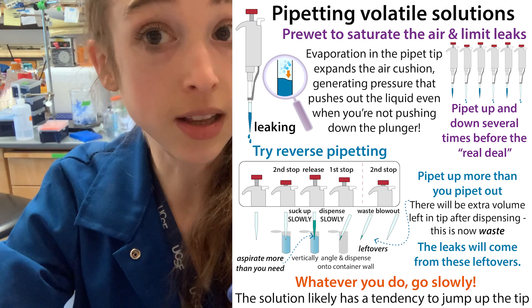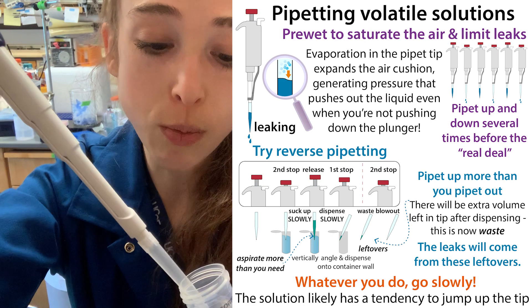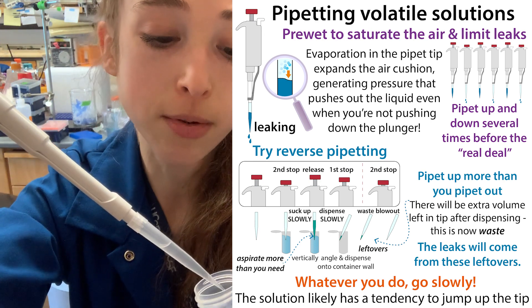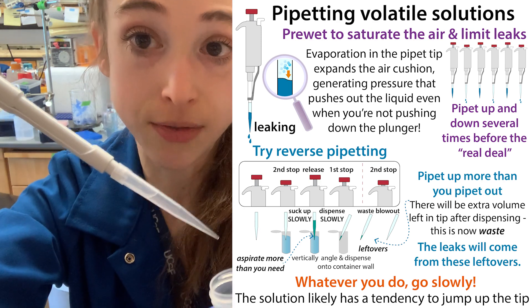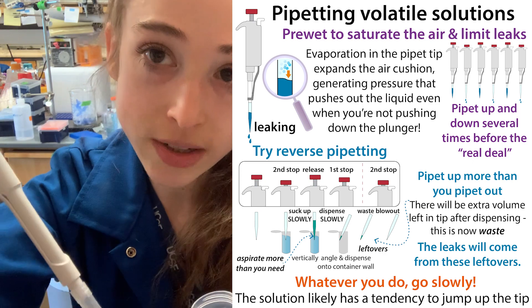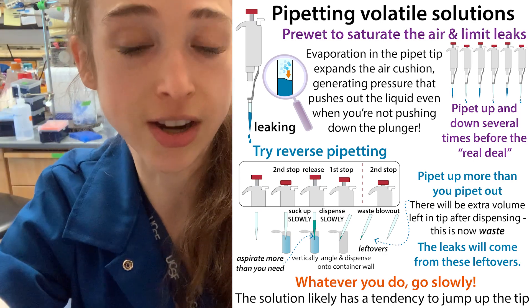To prevent leakage of ethanol or another volatile solution, use pre-wetting: pipette up and down three to five times before your actual pipette, and this will prevent dripping. You can also do reverse pipetting — you're still going to get dripping, but it'll come from the excess volume, not from the volume you actually care about.